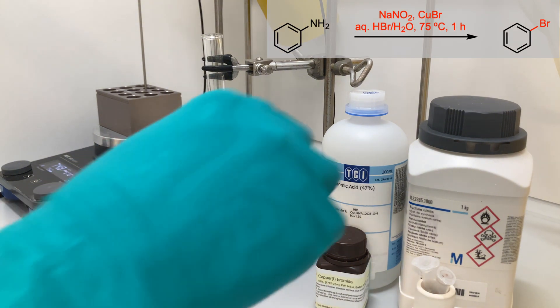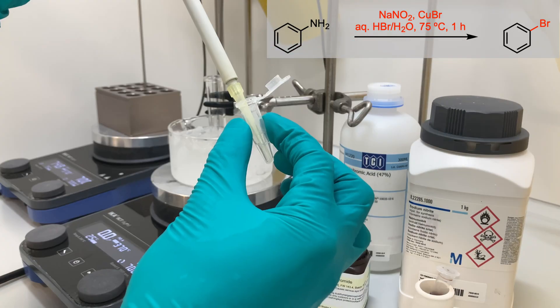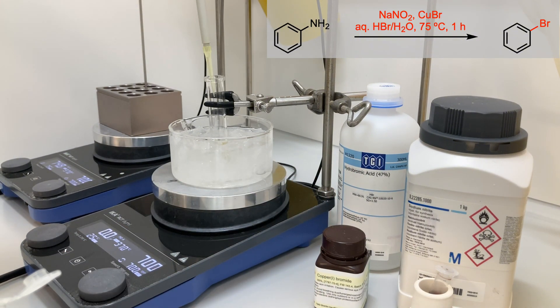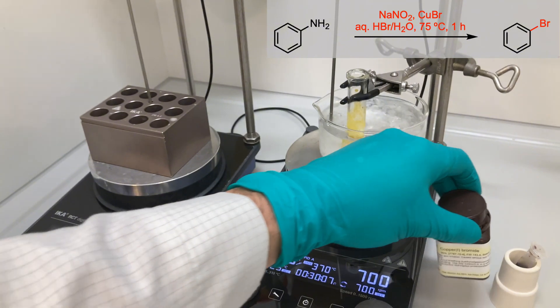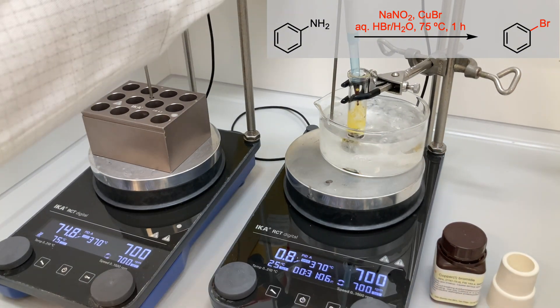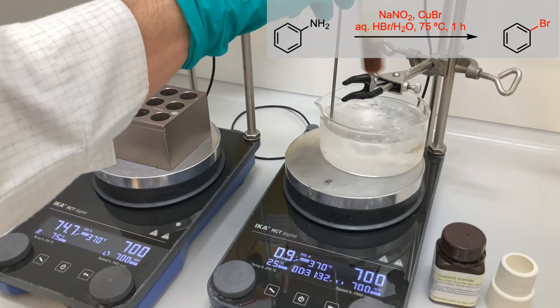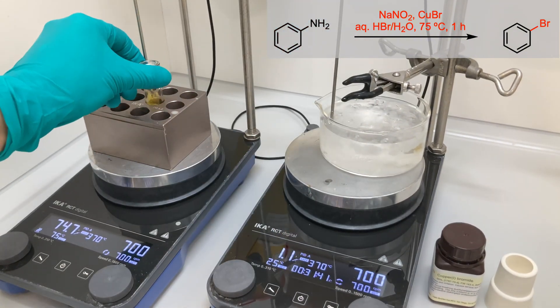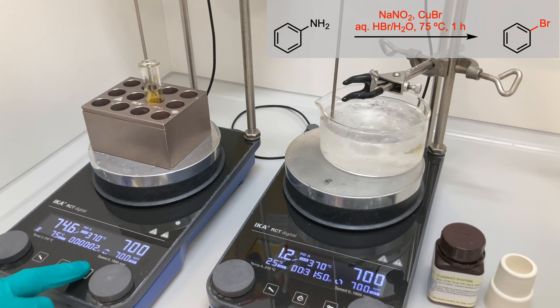Here's what I did. I started with a vigorously stirred solution of hydrobromic acid. After adding my substrate, I cooled the mixture to 0°C. Then, I slowly added an aqueous solution of sodium nitrite drop-wise at 0°C. After stirring for 30 minutes, I introduced copper-1 bromide dissolved in a 1-to-1 mixture of 40% hydrobromic acid and water. Once the addition was complete, I dried the pressure tube with paper tissue and placed it into a preheated heating block at 75°C.